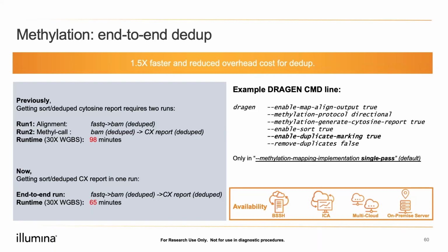So you can see on the right, those commands to enable this workflow, with the key one being enable duplicate marking true.